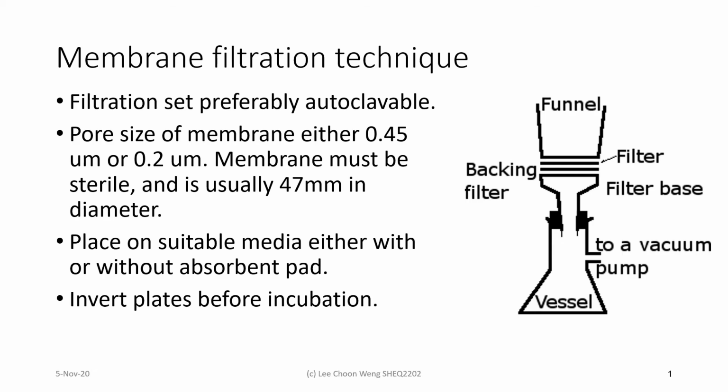In this video, we are going to evaluate the membrane filtration technique and how we should use this technique to calculate the number of bacteria per ml of sample. Okay, so the membrane filtration technique utilizes a set with a filter base and a funnel.